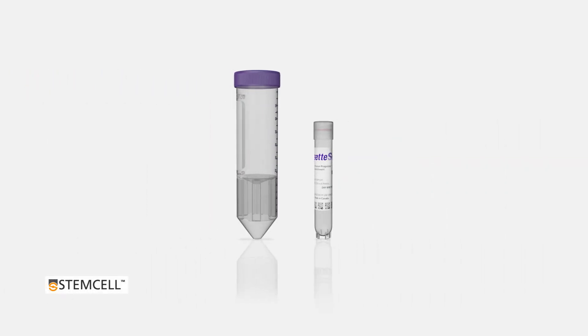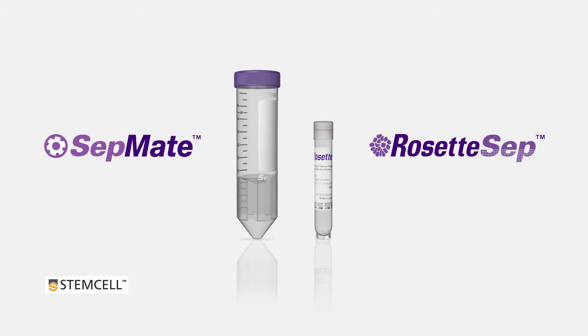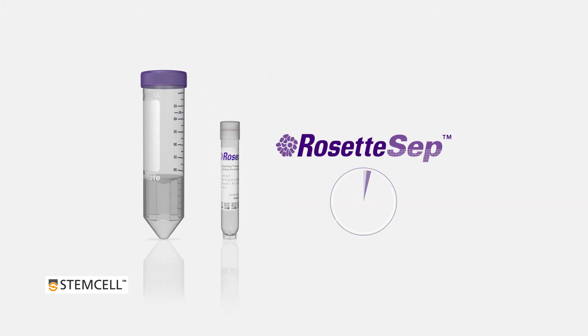CEPMATE can be easily combined with Rosette CEP to isolate a desired cell subset during the density gradient centrifugation step. This one-step cell enrichment system lets you go from whole blood to purified cells in just 25 minutes.